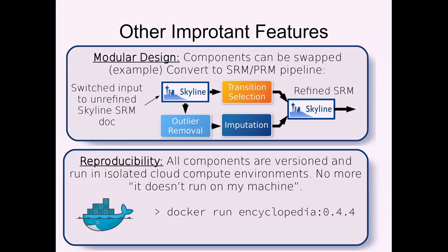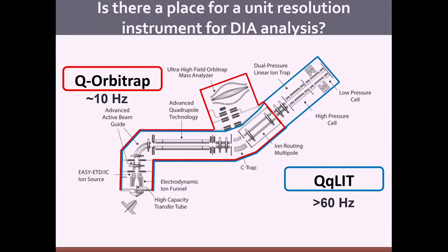So in the last 2 minutes, I know I'm over, I want to give another pitch for this. This is a very, very, very new thing that we've been thinking about, and that is: is there a place for a unit resolution instrument for DIA analysis?